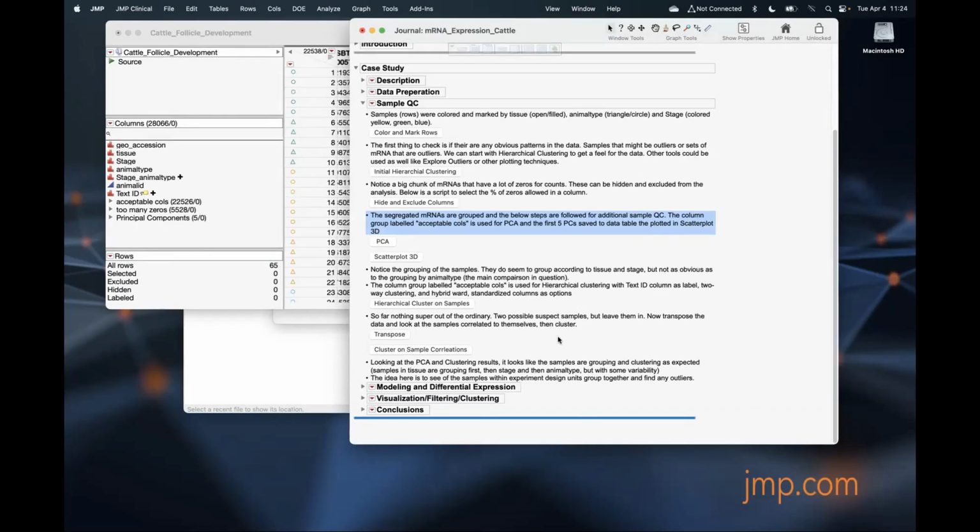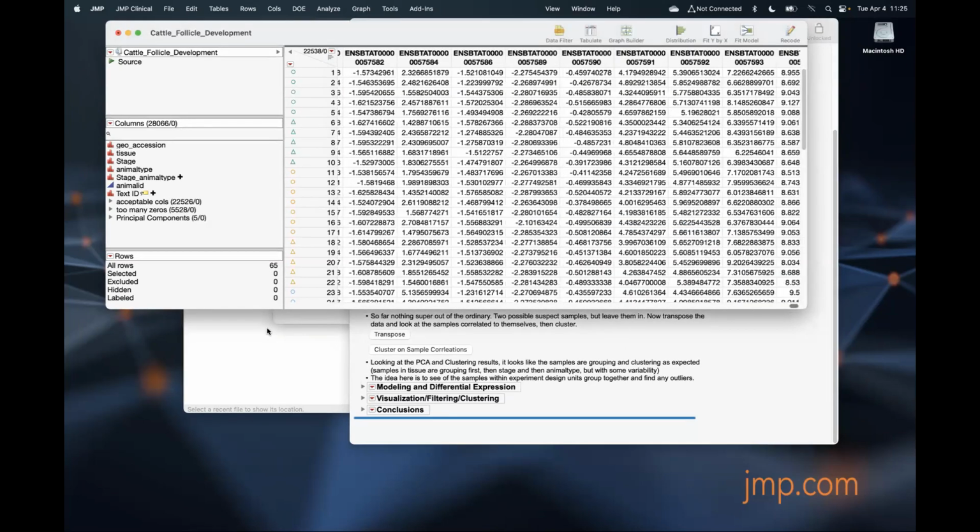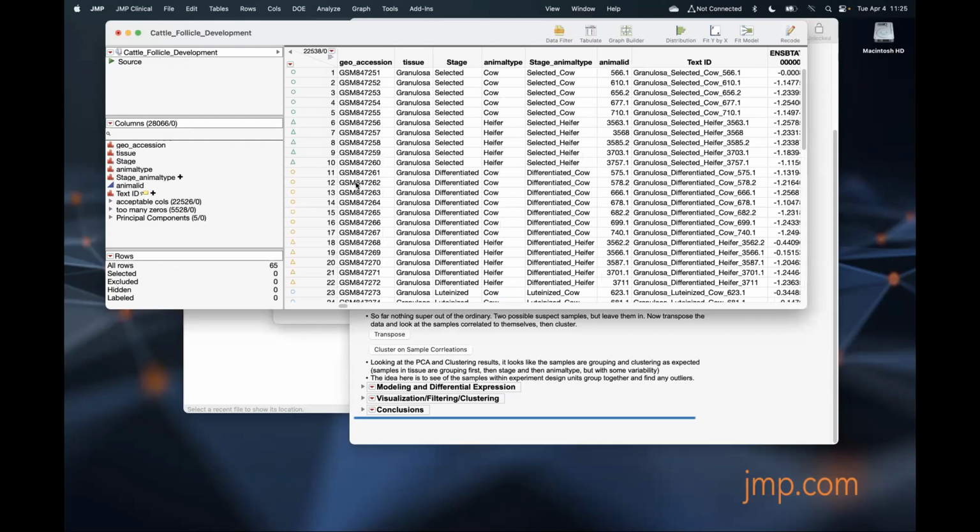The other thing we might want to think about is we might want to see the correlations between the two, right? I want to see the correlations of my samples to other samples. There should be a really good correlation sample behind this. So we need to kind of transpose this, right? Because everything is, I want to do this by that.